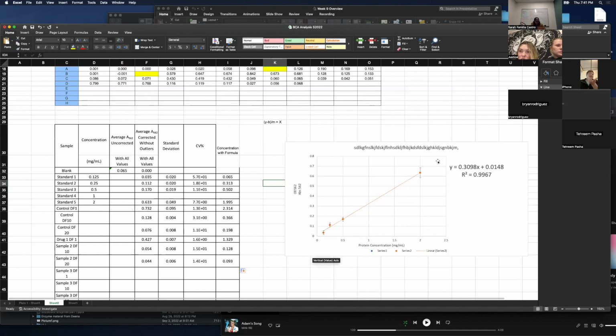Because we didn't test the absorbance versus concentration outside of this range, we don't know what the relationship is between absorbance and concentration. Some other formula might dictate it. We can't be sure our linear formula here dictates that. Like I said, almost everybody's data was fine.